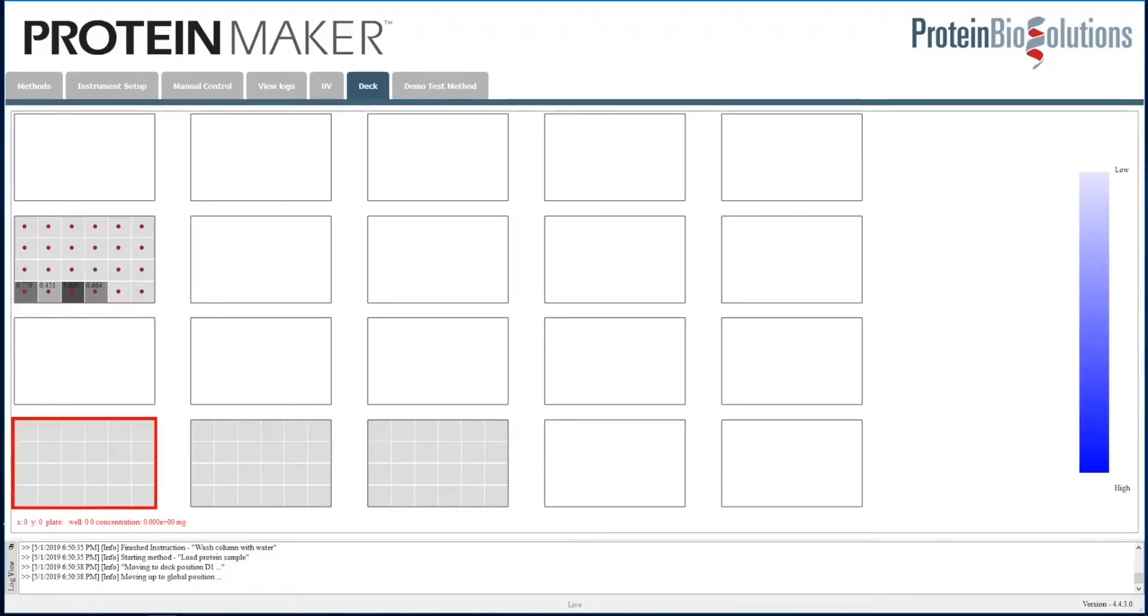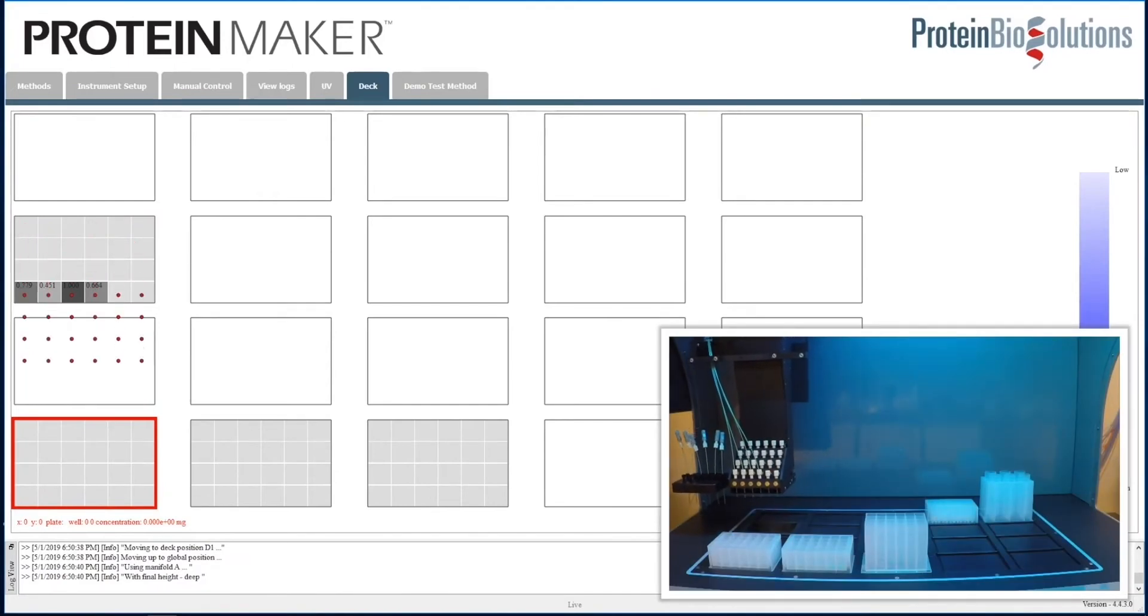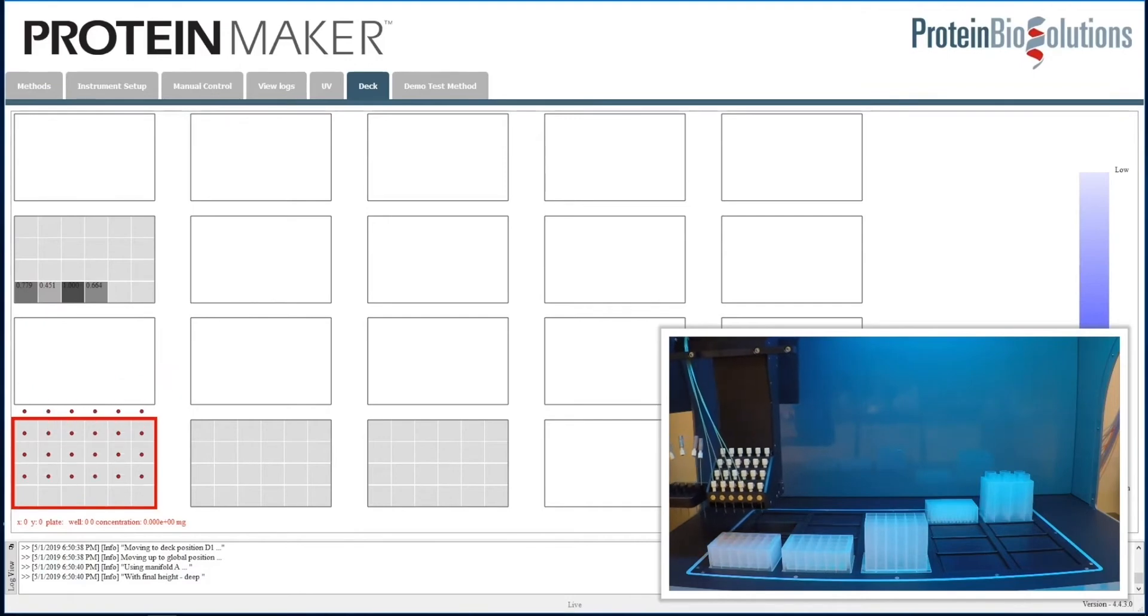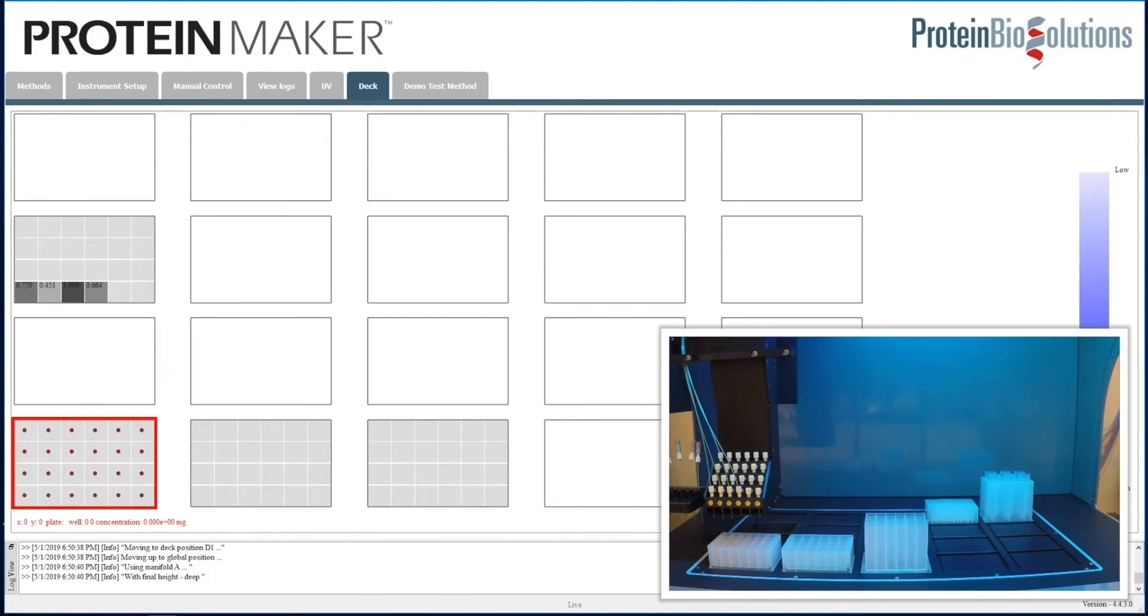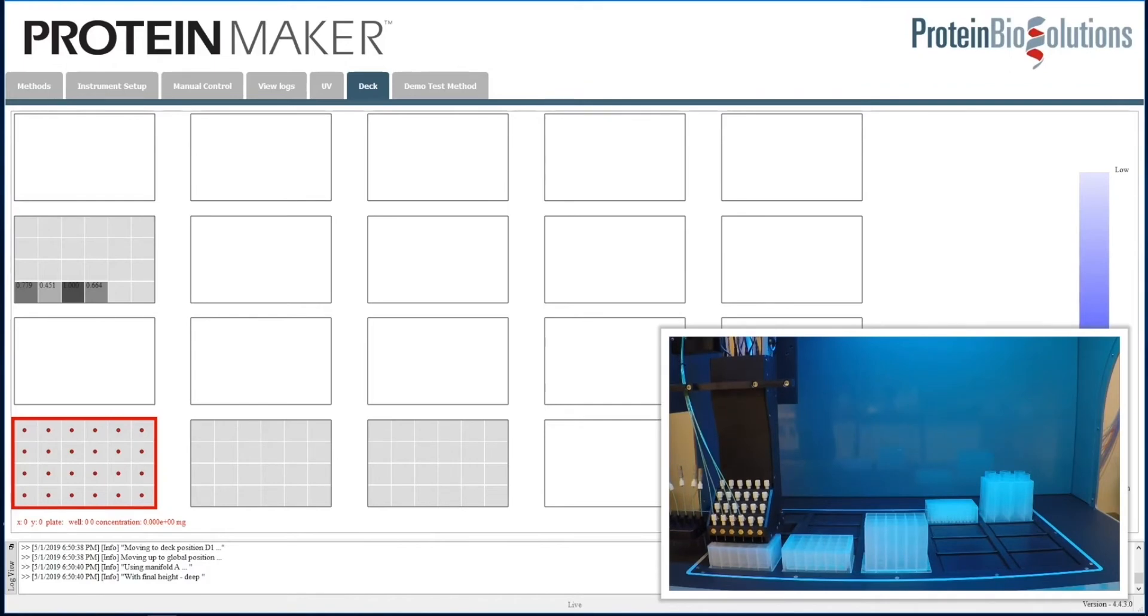Here we have the deck view of the software. The 24 red dots that you see represent the 24 needle positions, of which we just have the four connected in this video. You can see that it animates the red dots to show you the movement of the robotic arm, and here we have the picture in picture to show that movement to the left front position, which is holding a plate for collecting the flow through.